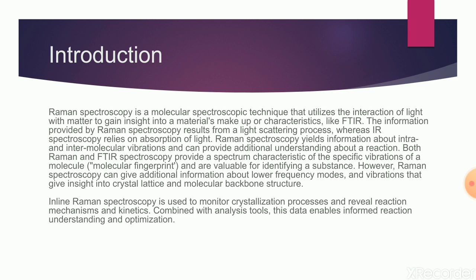Then, Raman spectroscopy requires little to no sample preparation and is insensitive to aqueous absorption bands. This property of Raman facilitates the measurement of solids, liquids, and gases, not only directly but also through transparent containers such as glass and plastic. Raman spectroscopy is highly selective.